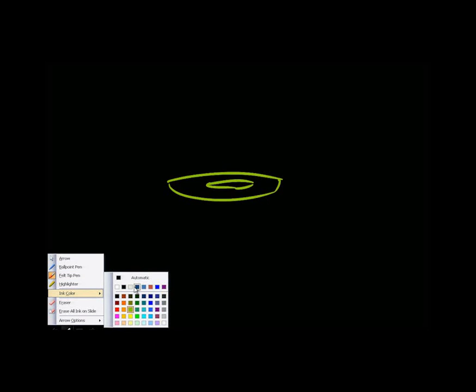It looks a little bit like this, literally. And we have an electron beam. Let's pretend it's fat, because remember, it's not a single file of electrons. It does have some width dimension. So here comes our electron beam, and by selecting a certain aperture, some of that beam does not continue to pass down through the column.